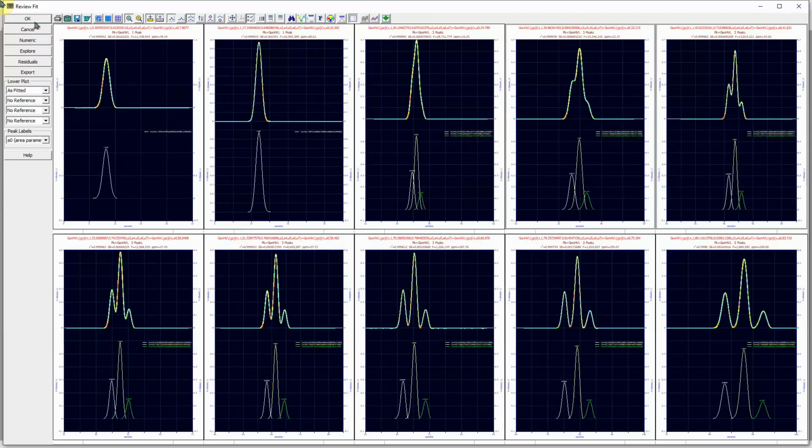The purpose of this was to show you that in this study, where the individual peaks themselves were given different widths in the generated data, and we forced those widths to be constant, we still had reasonable fits, and we were able to recover these areas to a high level of accuracy in sets of overlaps where you can barely discern the individual peaks, and in this case you wouldn't have easily been successful without the capabilities of the second derivative identification method for the hidden peaks.